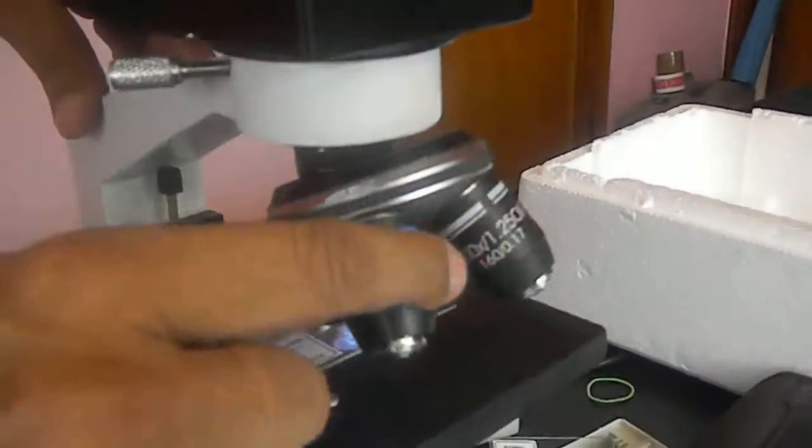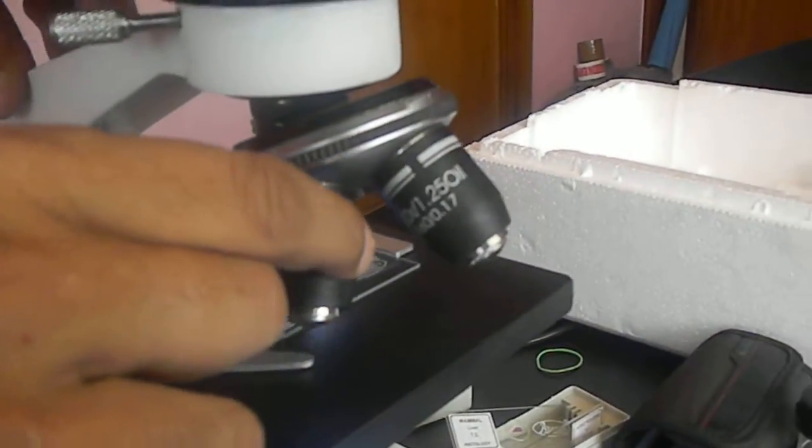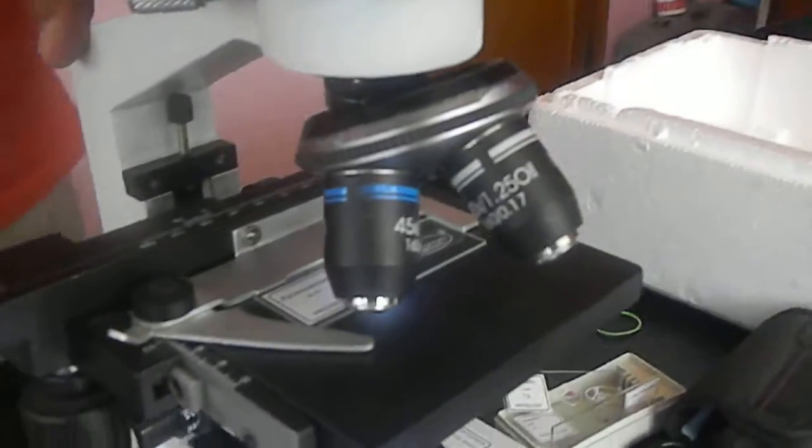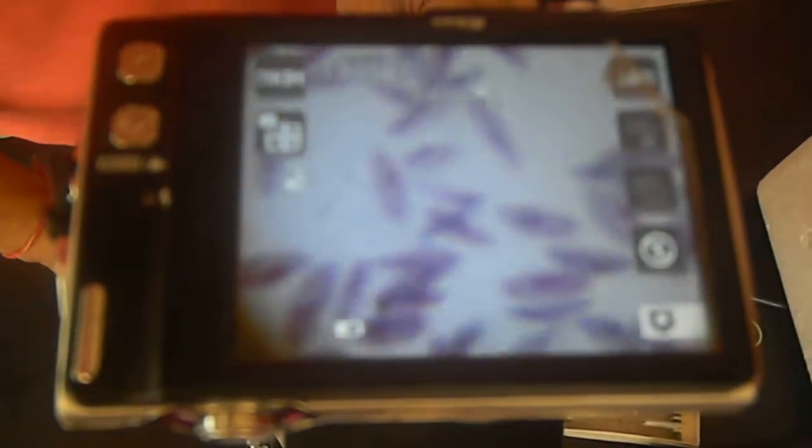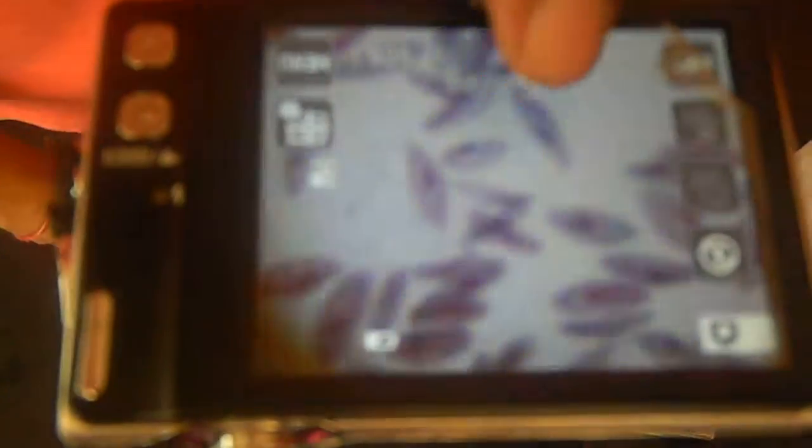Now I go to 10x objective and then change it to the second. Now you can see the image has become bigger. It is automatically focused but still you can change it, checking this image visually. You can change it. And then it is in focus.